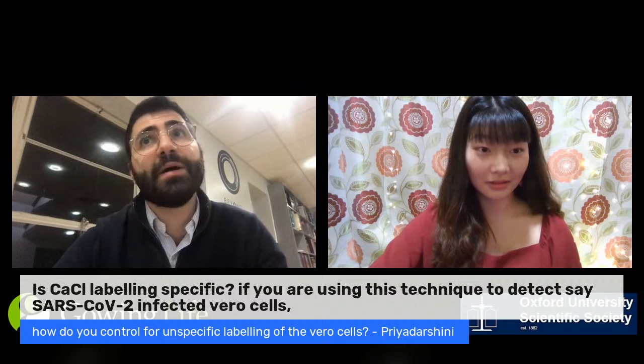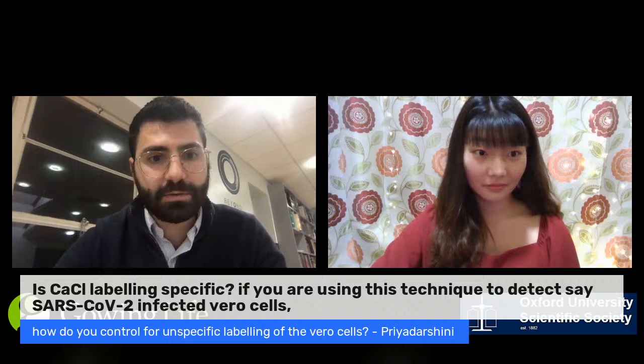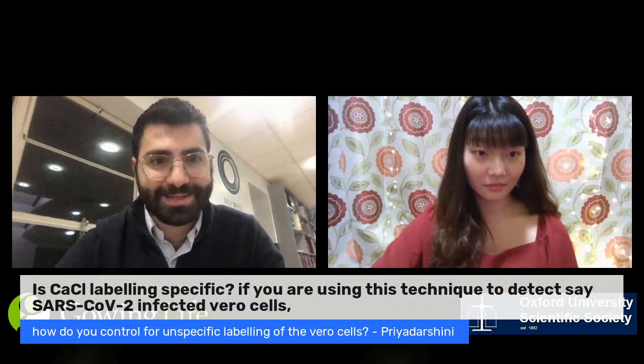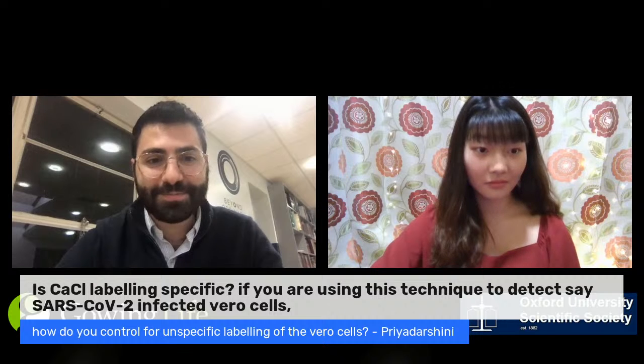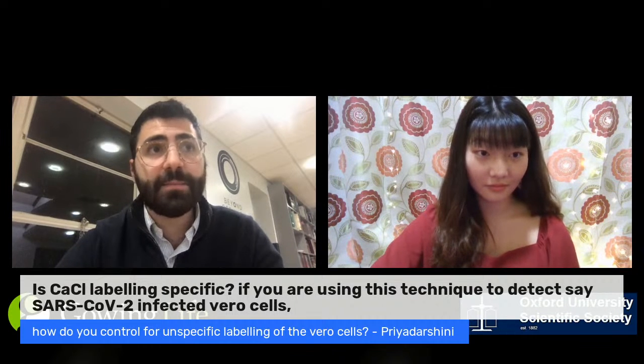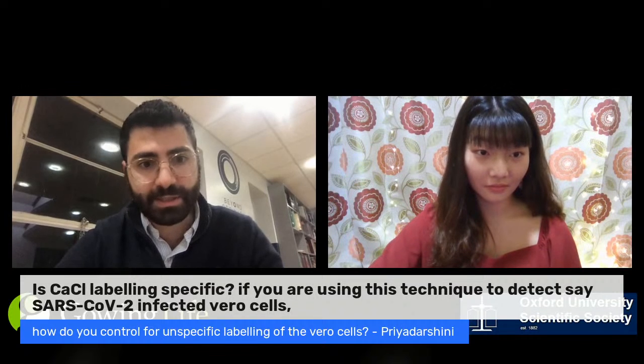So part of the thing I haven't covered is how we stick the virus. We use a biopolymer called chitosan. This is really good at sticking small stuff, but not very good at sticking big stuff. So essentially, it does label other kinds of cells, but we never see them on the surface. And that's part of the reason why I use TIRF, total internal reflection microscopy. And it is not specific, it's unspecific. So it labels anything with a membrane. That's the way it works.